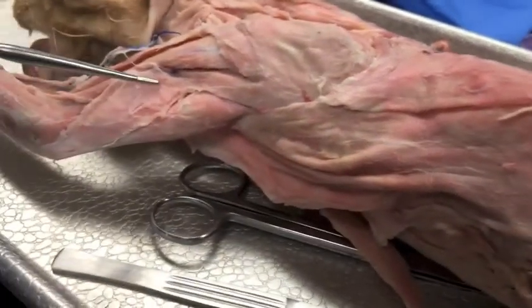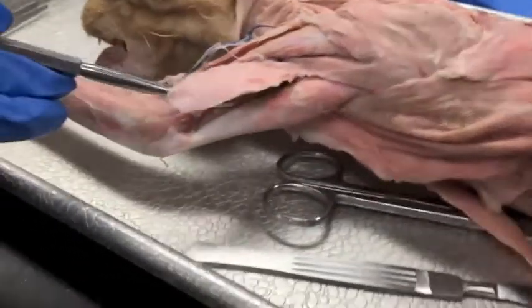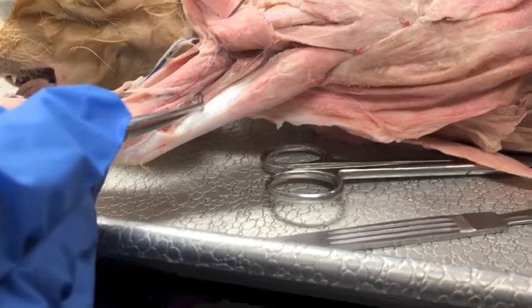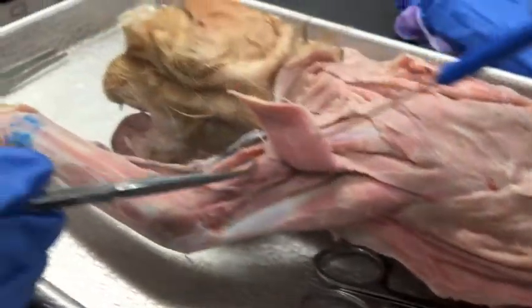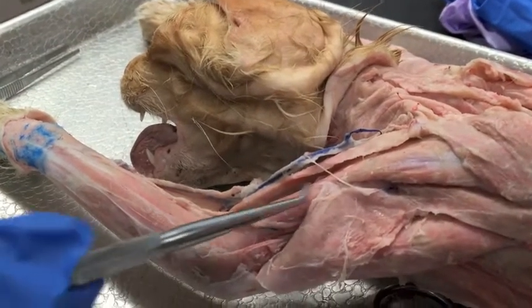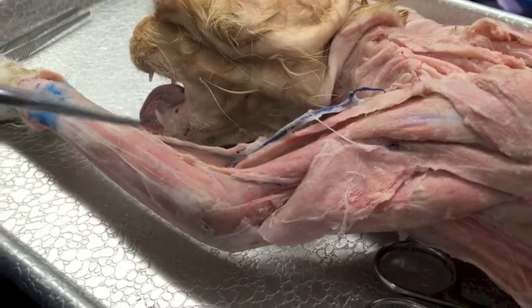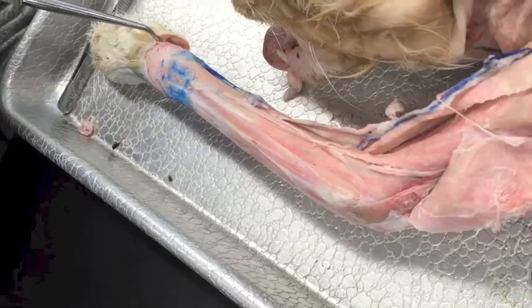Then we have the lateral head of the triceps brachii, the medial head of the triceps, the long head of the triceps brachii, right here is the brachii — brachialis — and the brachioradialis, which connects all the way over here.